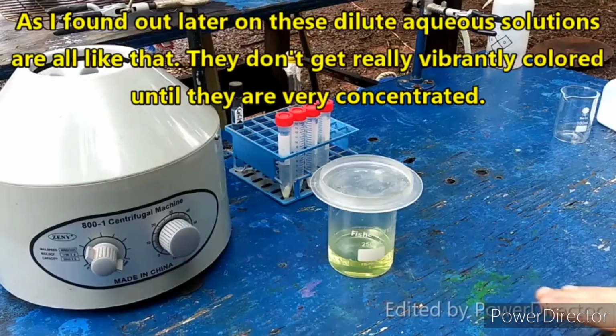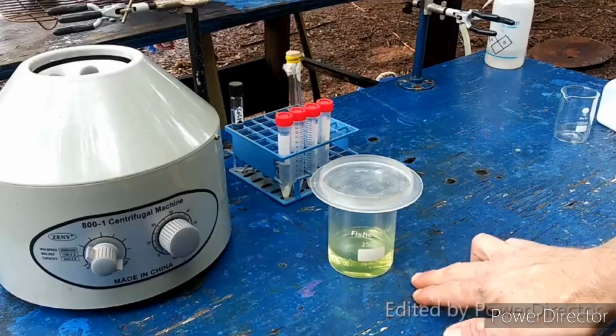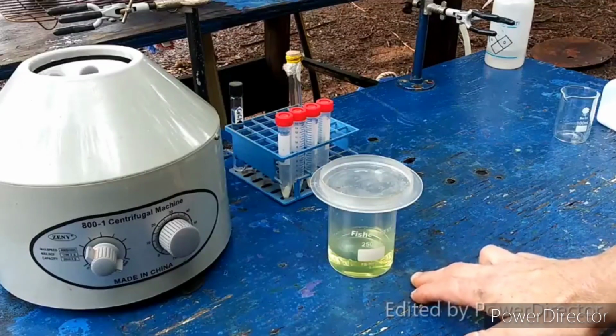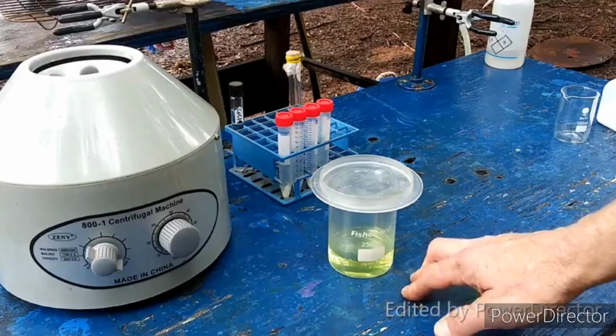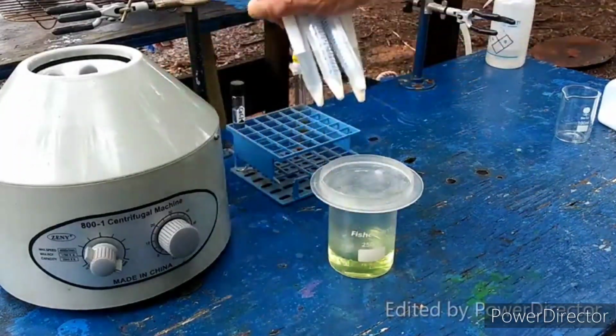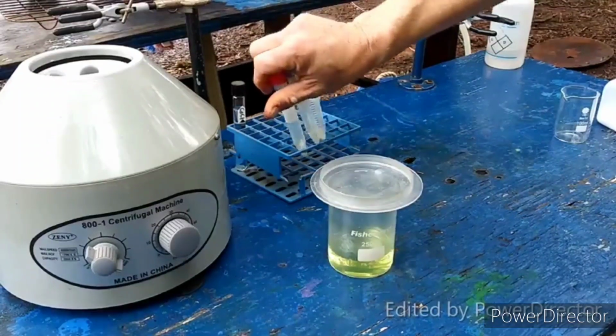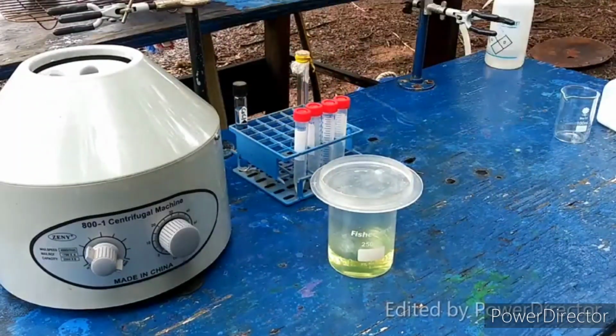Alright, so what I'm going to do now is go and prepare a solution of cesium chloride that is 2 molar equivalents for the amount of uranyl sulfate that we had. Yes, I know there's a little bit in the bottom of this. No, we're not going to mess with it. It doesn't really matter. It's not very much, on the order of milligrams. So I'm not stressing over that.